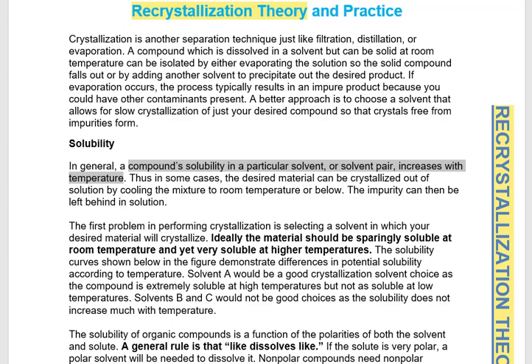Now, an ideal recrystallization solvent is one where your compound of investigation is not very soluble at room temperature. You'll still see the solid, it won't dissolve. However, at higher temperatures it will dissolve, and this would make a very good recrystallization solvent, especially if you're trying to separate a solid mixture that has more than one component.